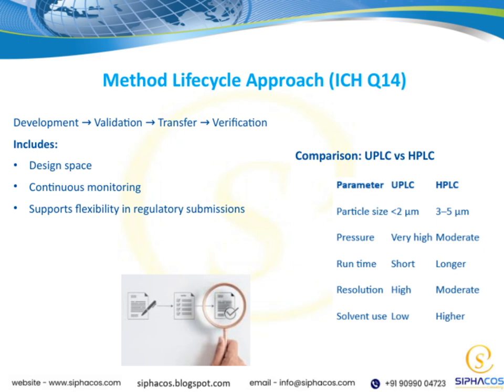It helps streamline communication with regulatory bodies and demonstrates a robust, science-based understanding of the process from development through to verification. So, in essence, UPLC not only enhances analytical performance, but also aligns with a proactive, risk-based approach to pharmaceutical development and manufacturing, making it a powerful tool in today's regulated environment.